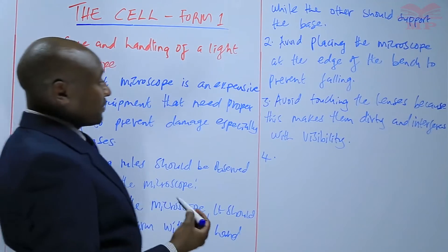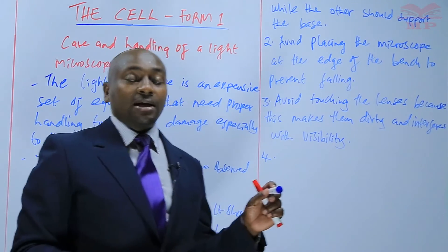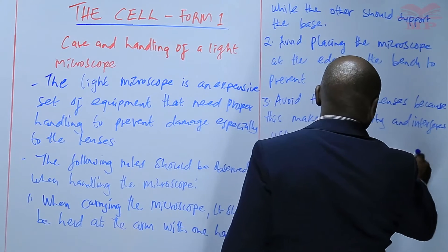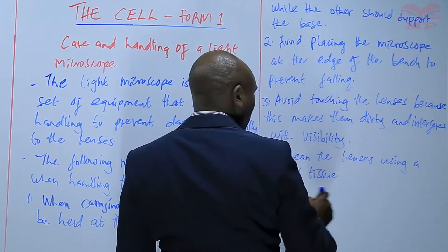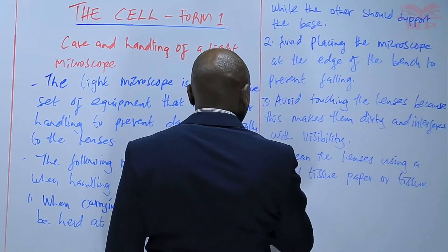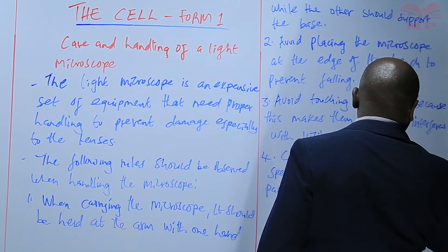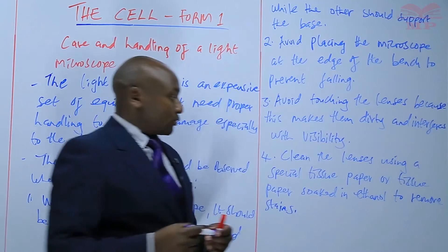Number four: while cleaning the lenses, a soft tissue or a special tissue meant for lenses should be used. Clean the lenses using a special tissue paper or normal tissue paper soaked in ethanol so that you are able to remove the stains.